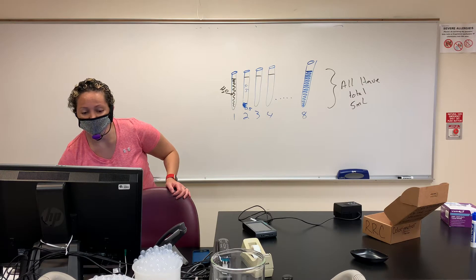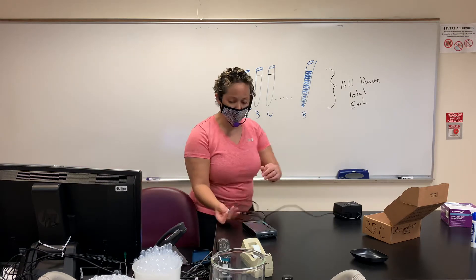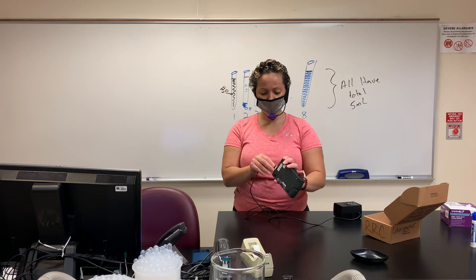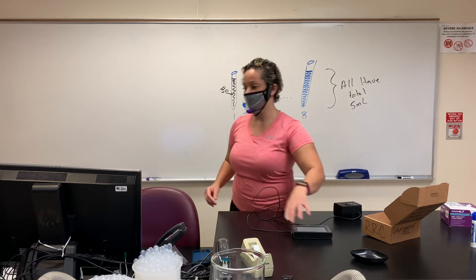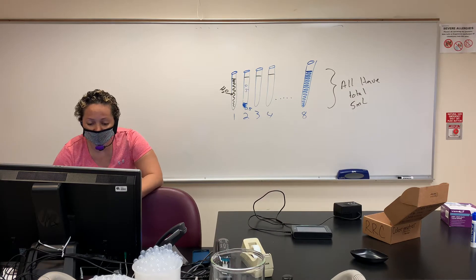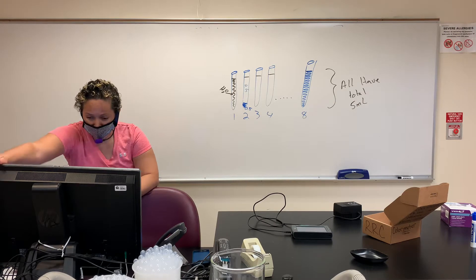So what we have to do is set up our colorimeter — that is the first thing. While you're waiting, go ahead and turn on your Vernier — I call it your little computers — and plug in your colorimeter. It needs to warm up for 90 seconds.